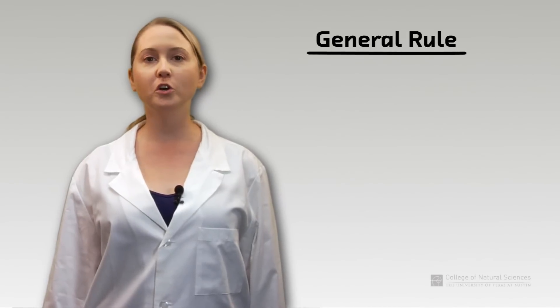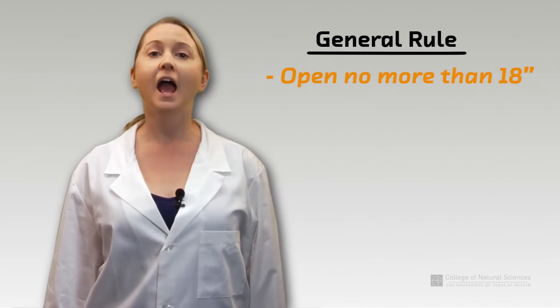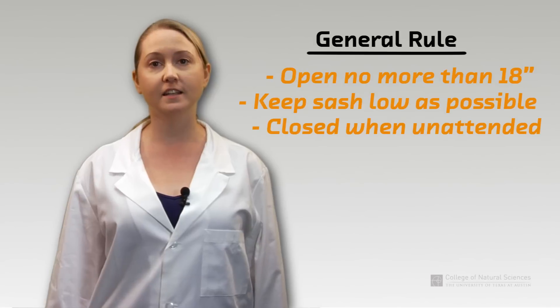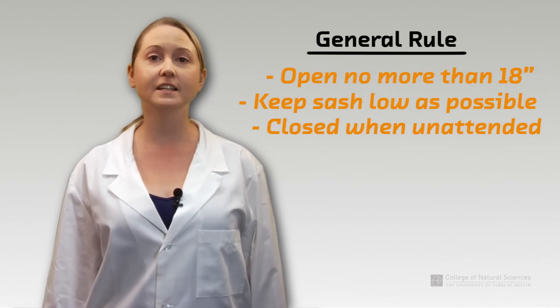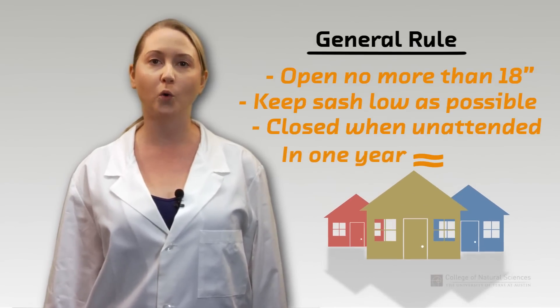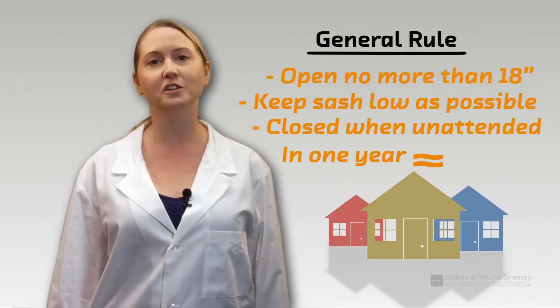As a general rule, the fume hood should not be open more than 18 inches when you are working and should be kept as low as possible. A single standard fume hood open to 18 inches in one year uses about as much energy as it takes to power three homes. Keep the sash closed as often as possible for your safety and the good of the environment.